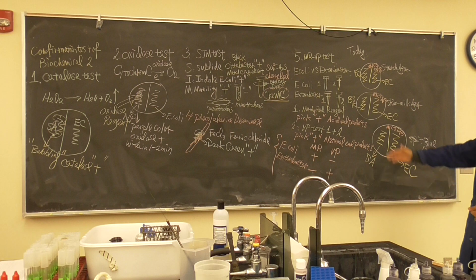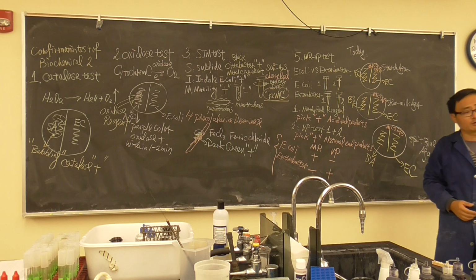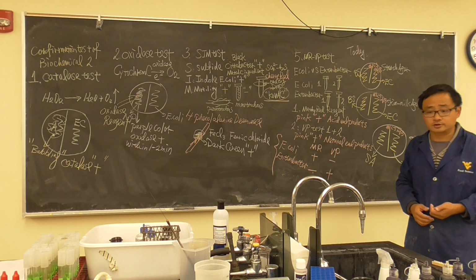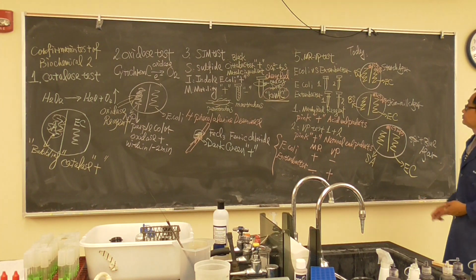So the work is very simple. We do the incubation afterwards. We look at whether there is a transparent zone surrounding the colony. We want to talk about all these one by one.